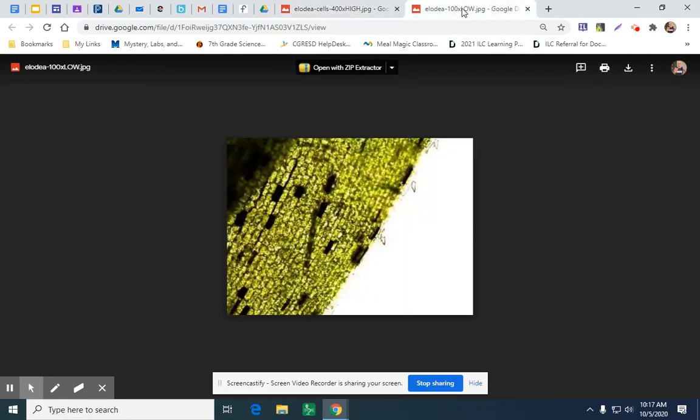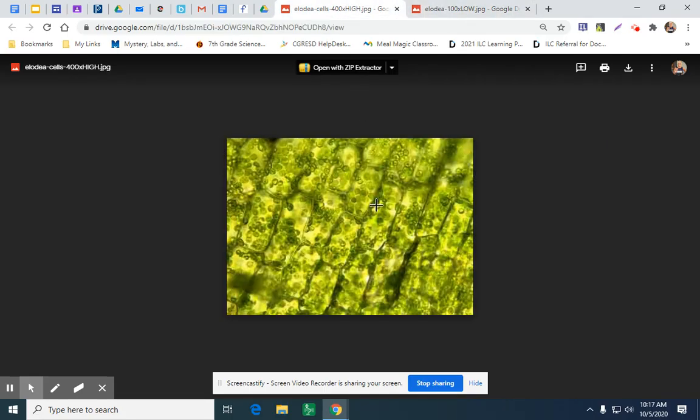So now that we know a little bit about what living things look like under the microscope, and we see the presence of organelles and that nuclei are very visible in most specimens, we're going to do a mystery sample, look at 3 mystery specimens and try to decide if they're living or non-living based on the properties of their cells or whether or not they have them. So stay tuned.